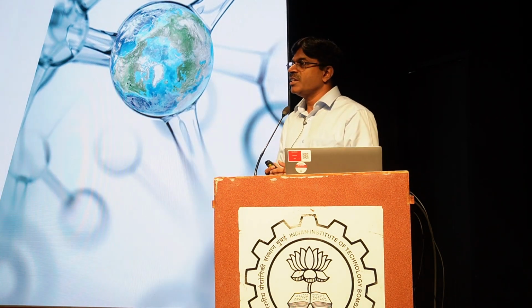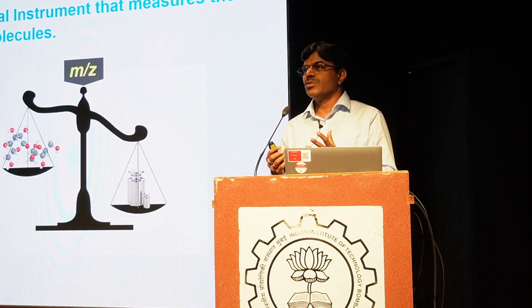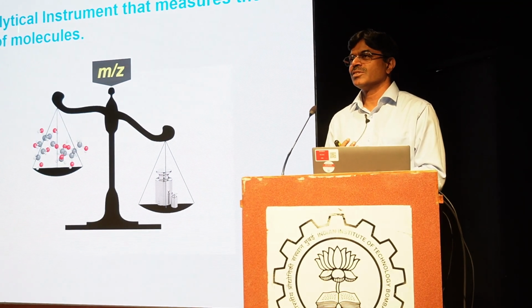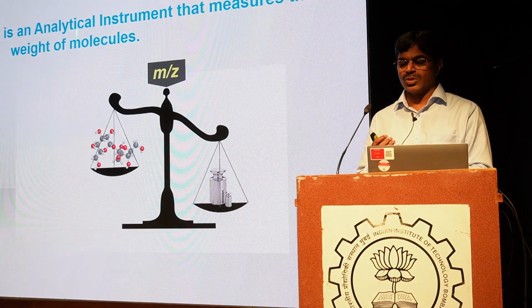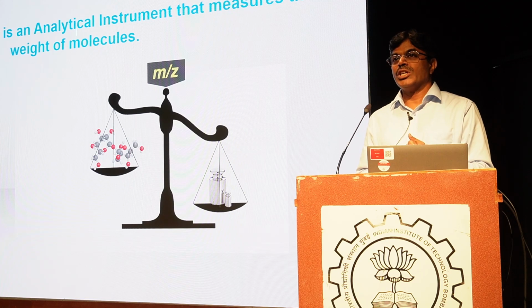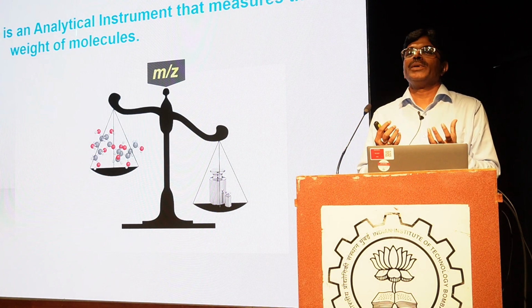So let us see the fundamentals of HRMS. What is mass spectrometry? It's nothing but a molecular balance, just to weigh your molecules. It gives me the molecular weight of my molecules. But one important thing about this mass spectrometer is you require your molecules in gaseous phase. It should not be in a liquid phase.